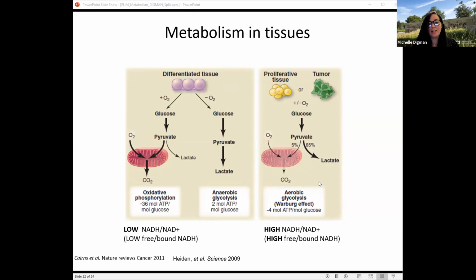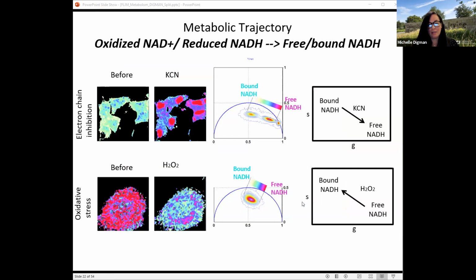So in this case, they could actually produce ATP at a faster rate than oxidative phosphorylation. One of the ways to characterize this shift on the Phasor plot, and many other people have worked on this, Melissa Scala's group has worked on looking at free and bound NADH. But what's nice about the Phasor analysis is that you can see this shift very easily.